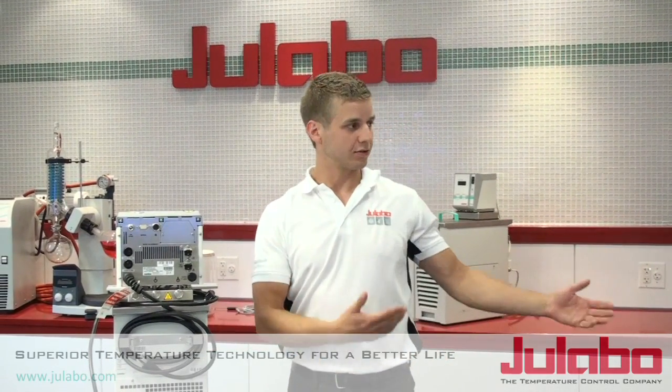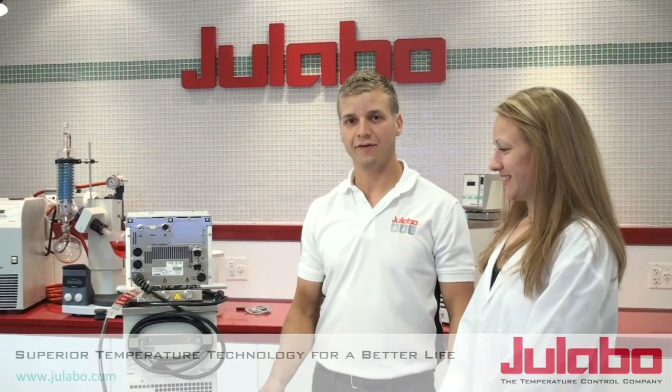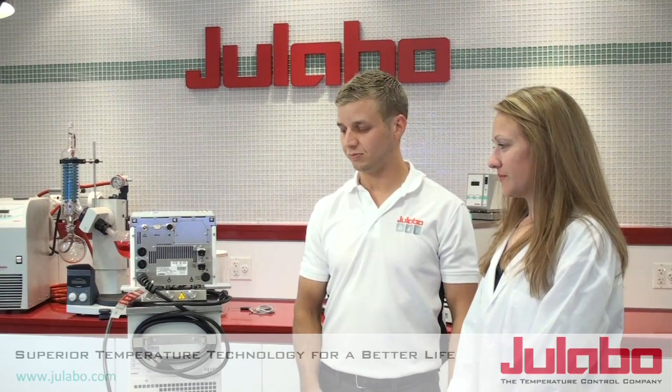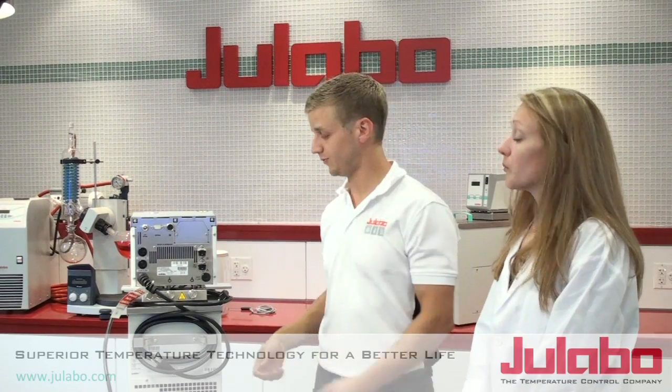Today I'm helping Dr. Lori install her high-tech series F25HL, but note that the procedures that we're going to be going through are the same and typical for a lot of Ulabo heating and refrigeration circulators.